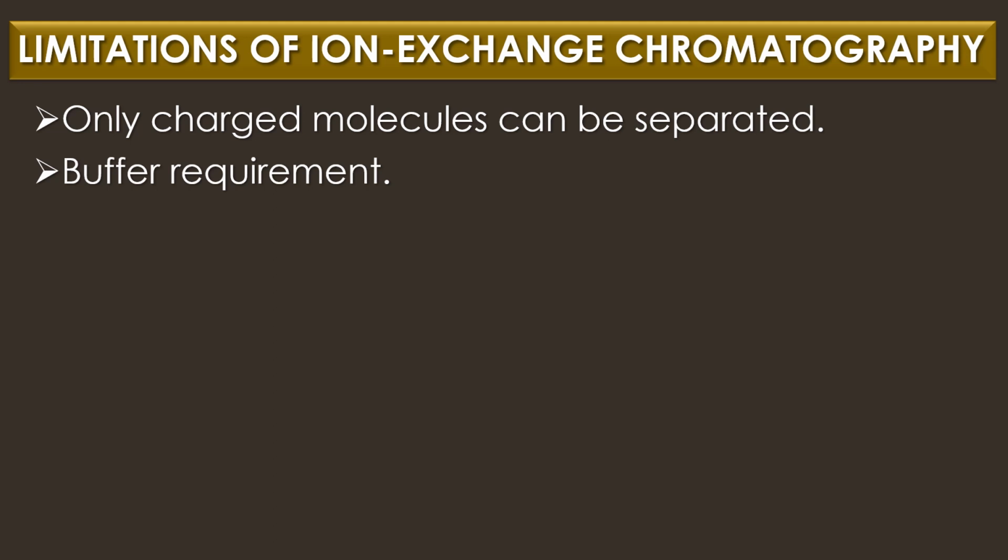Finally, limitations of ion exchange chromatography. There are two limitations. The first limitation is only charged molecules can be separated, and the second limitation is buffer requirement.